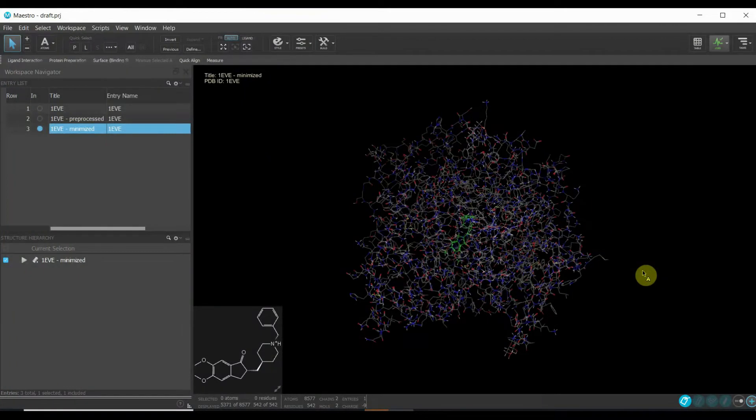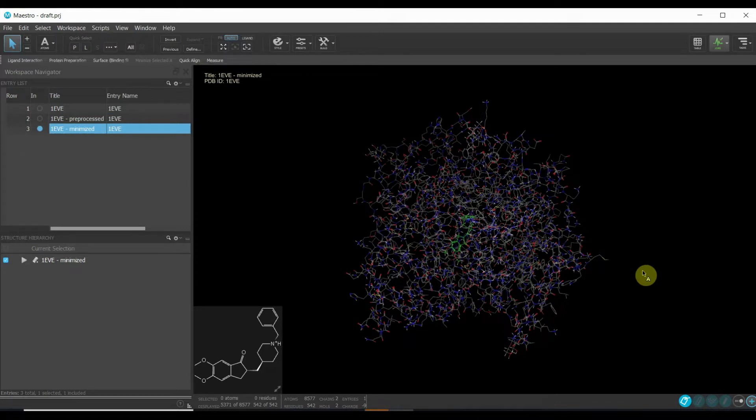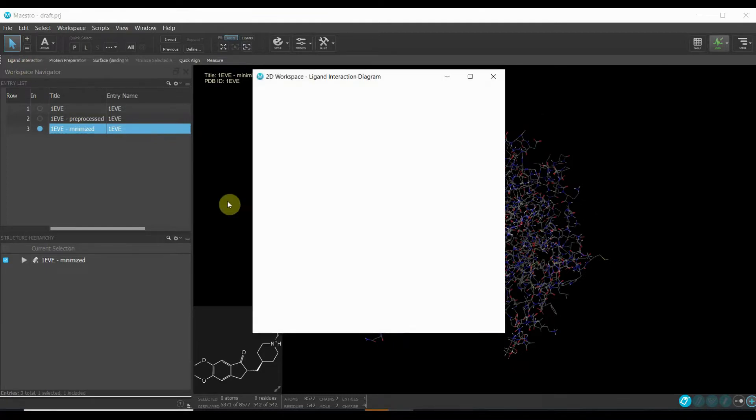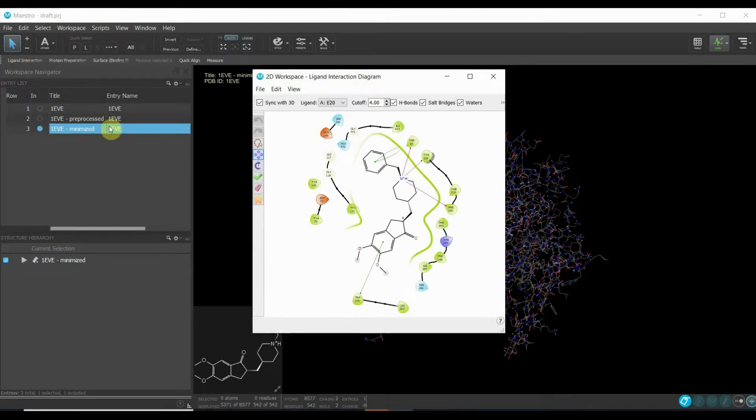Hello there, so today we have assembled here to see the ligand interactions with the protein. The easiest way to see how your ligand has interacted with your receptor in the binding site is to come to this tab which says ligand interaction, and trust me this is the easiest one.